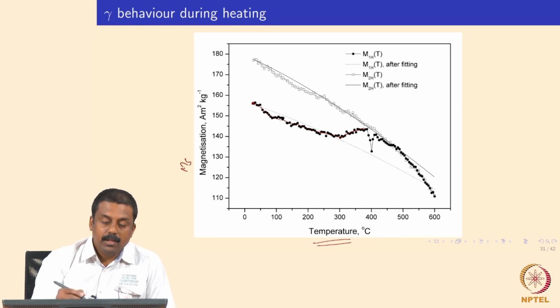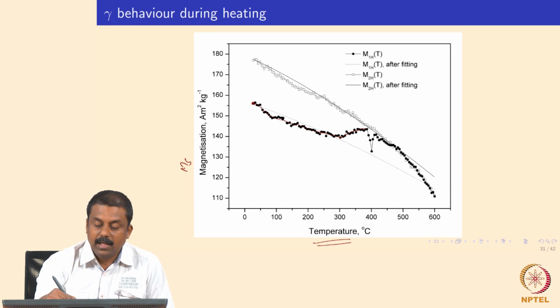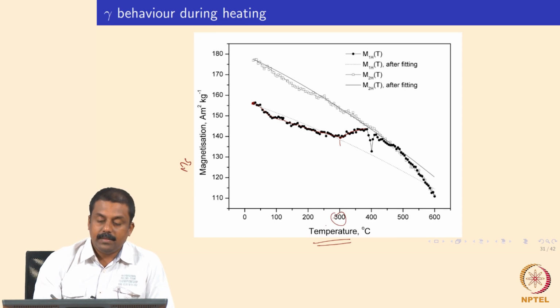ferromagnetic. So what this implies is you have a retained austenite containing TRIP steel, but when you heat it up, the mass magnetization saturation suddenly increases upon reaching a critical temperature, for example in this case around 300 degrees centigrade. That means that the microstructure is becoming more ferromagnetic, right? So if there is an increase in saturation, what does it imply? It implies that the microstructure is now becoming more ferromagnetic. That means that something happens to retained austenite, and retained austenite is converting into a more ferromagnetic structure, and we will see in subsequent slides what happens to retained austenite.